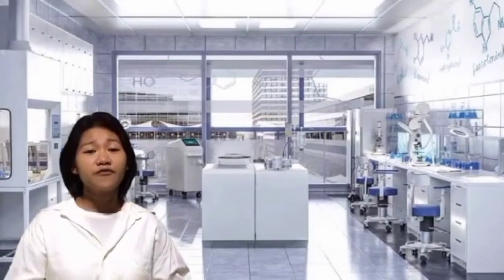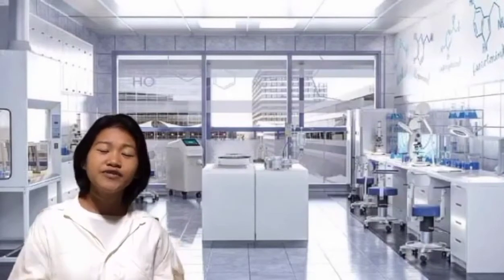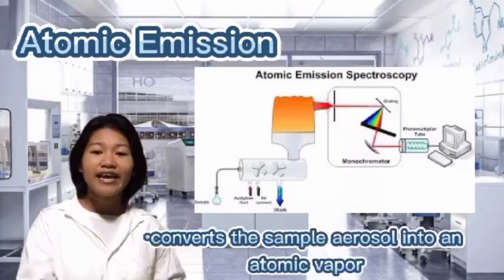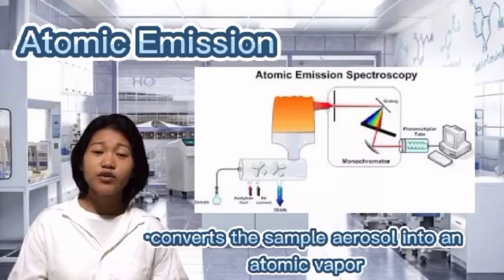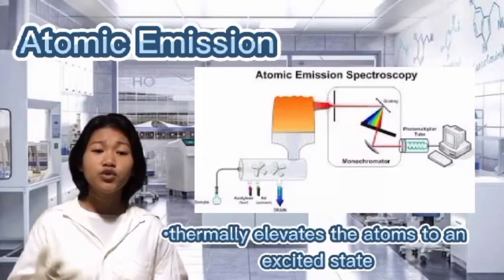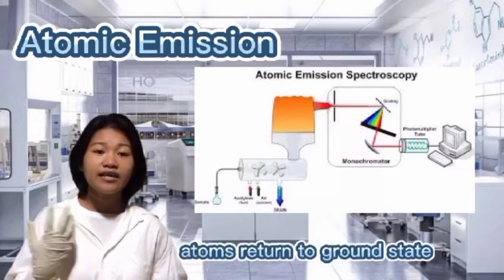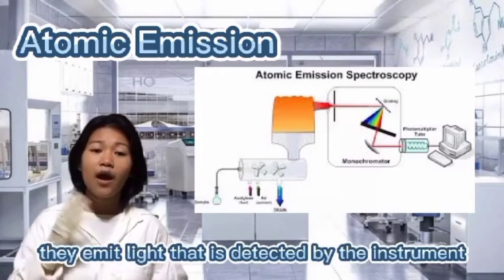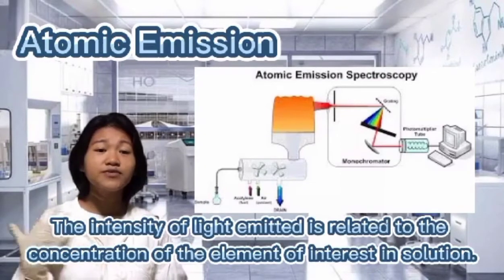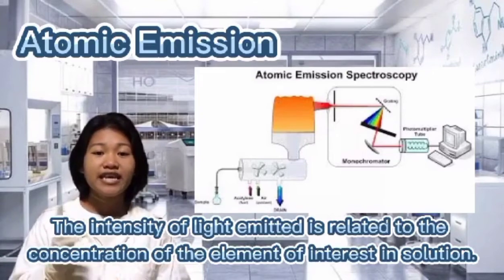There are some differences between atomic emission and atomic absorption. Using atomic emission, the flame serves a dual purpose. It converts the sample aerosol into an atomic vapor and then thermally elevates the atoms to an excited state. When these atoms return to the ground state, they emit light which is detected by the instrument. The intensity of light emitted is related to the concentration of the element of interest in solution.